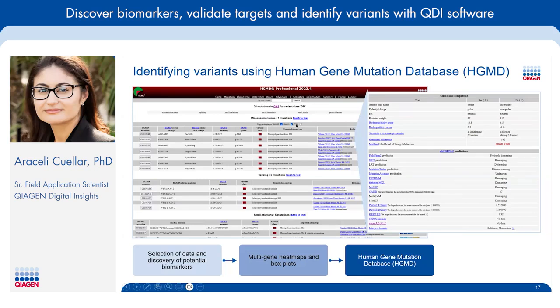Now, often users like you are interested in identifying variants in genes or targets of interest.